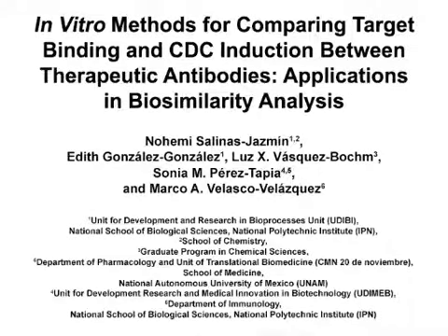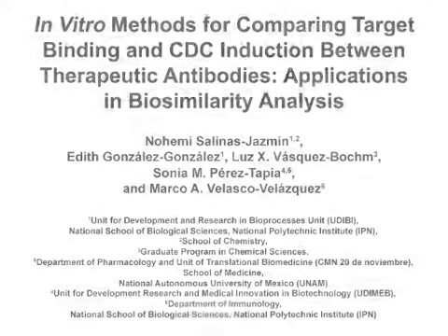The overall goal of this procedure is to compare two key functional characteristics between therapeutic antibodies, target binding and CDC induction, during their biosimilar development or as a quality control during their production.